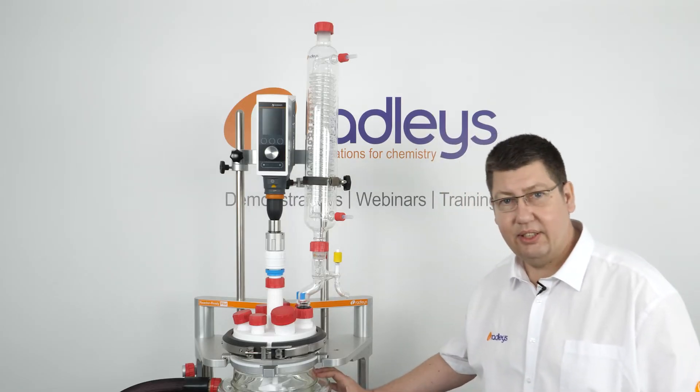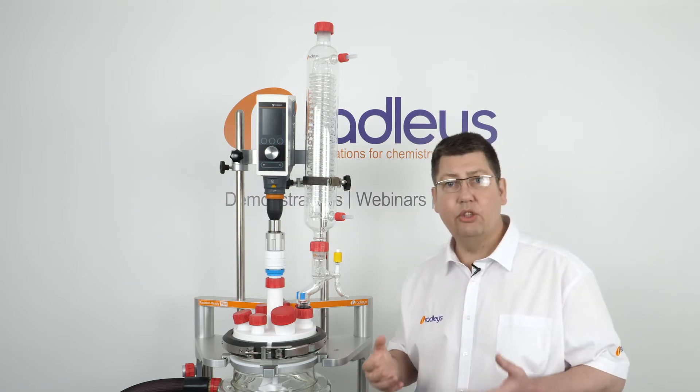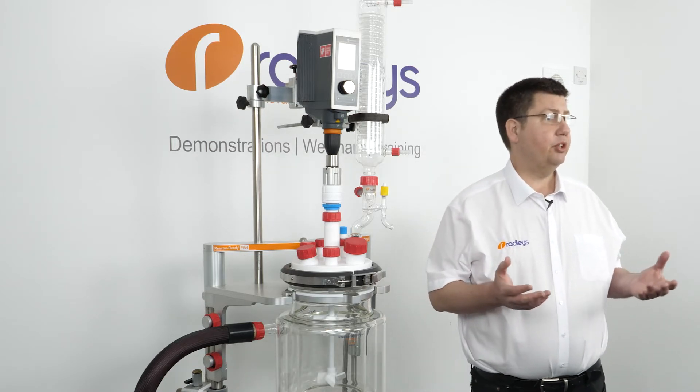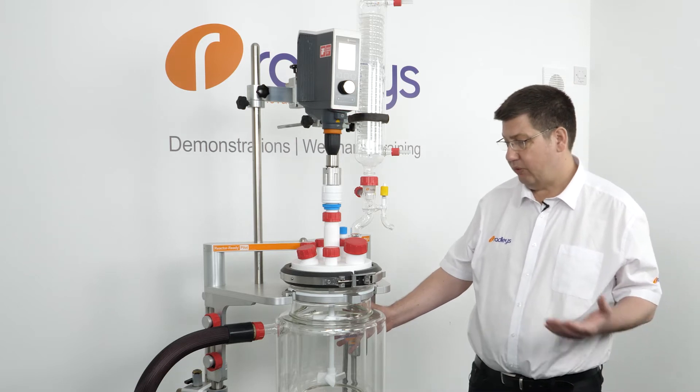Drying glassware like this in situ is generally accepted as the preferred way to eliminate moisture in the system prior to use. The techniques used are the same as when using a vacuum oven — we apply a gentle heat and a vacuum for a period of time.